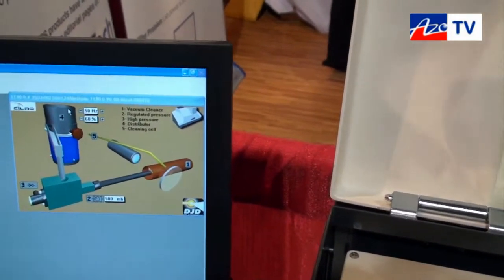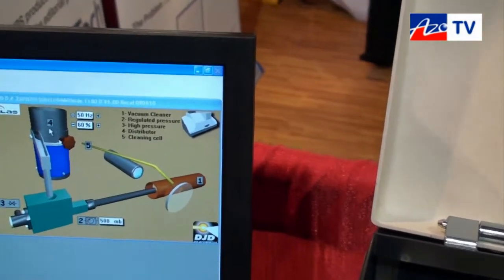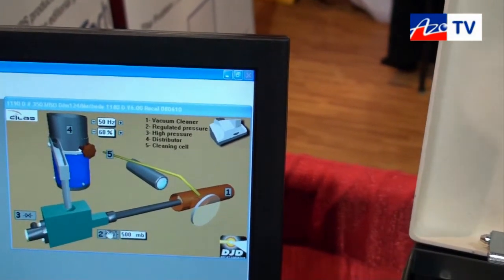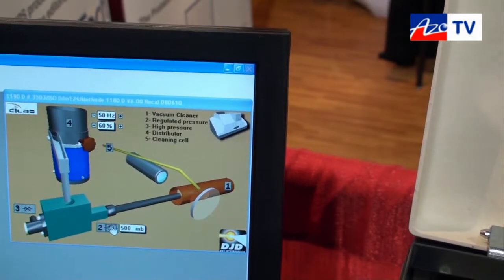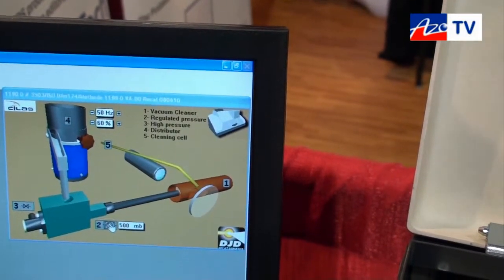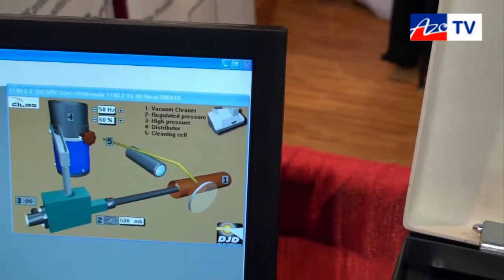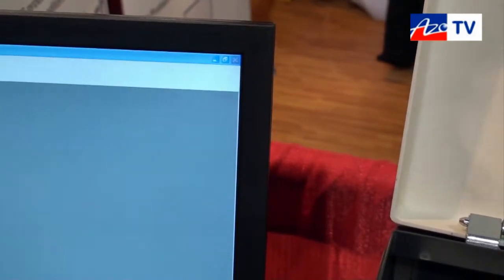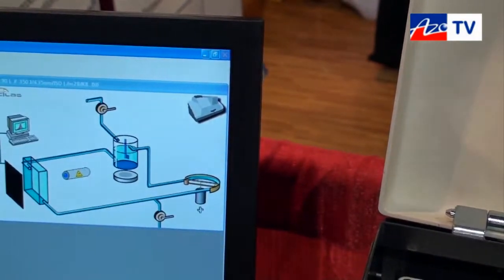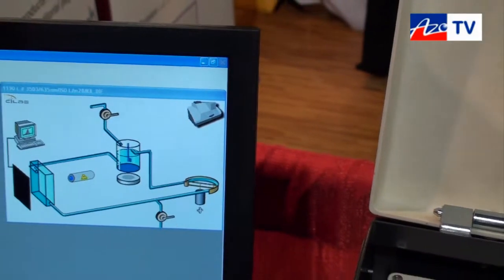So instead of seeing a tank and a stir we have a vacuum, a vibratory feeder, air pressure that we can vary from 100 millibars up to 8 bars of pressure. If I want to go back to liquid we can press the icon again and then we go back to liquid dispersion mode, so in the hardware there is nothing moving at all.